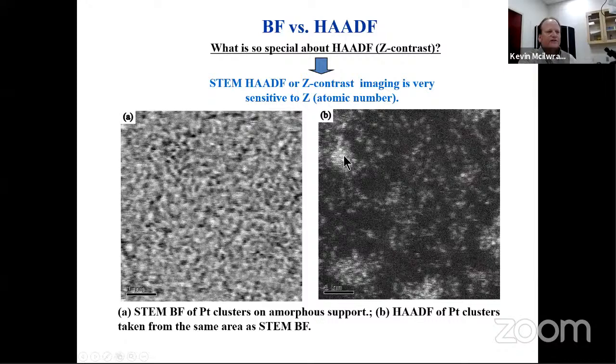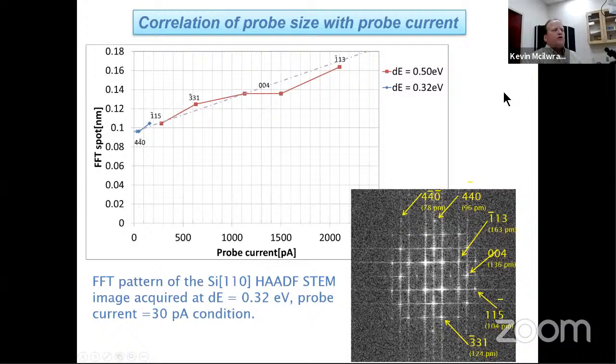Thicker samples too. Now, this is just quick to show you that as we increase our spot size, we start to ramp up our probe current. And that becomes very large when we get out to, this is only a 1.7 angstrom spot, but we're at about 2 nanoamps, and there are things to even get beyond that, right? But there are problems sometimes because we'll start drilling samples.